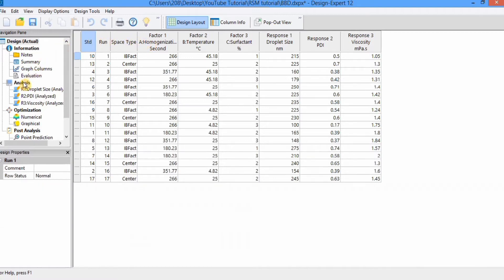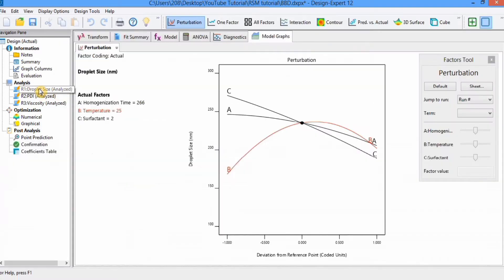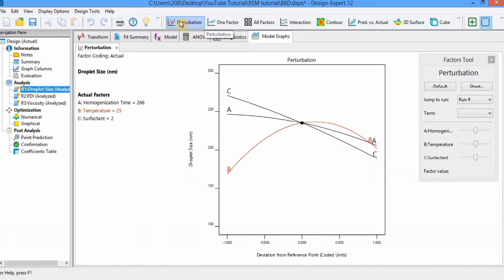In the analysis section you can select any response for which you want to generate a graph. For example, I want to generate a graph for droplet size, so I will select this one. Here you can see different tabs. Click on model graph and different graph options appear: perturbation, one factor, all factor, interaction, contour, 3D, and cubic.